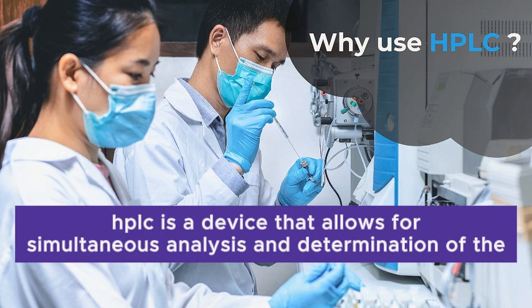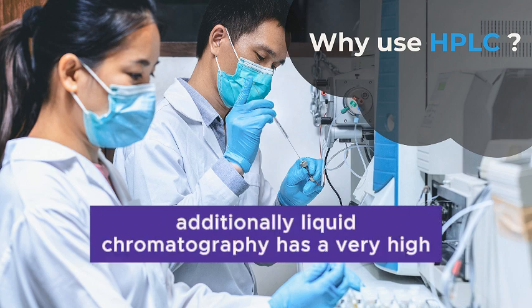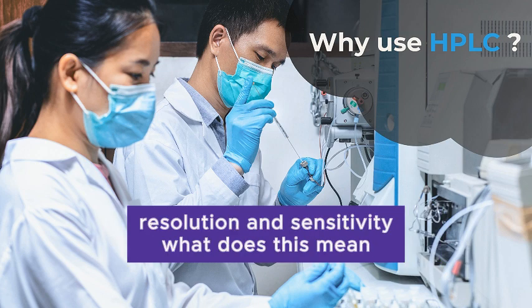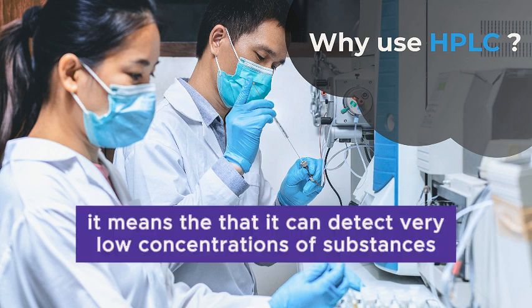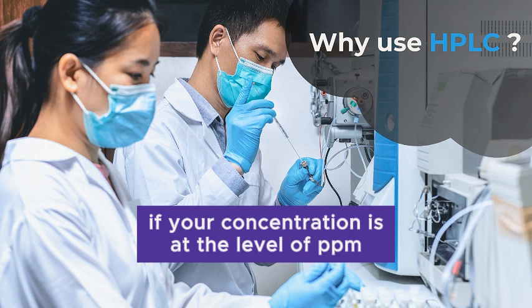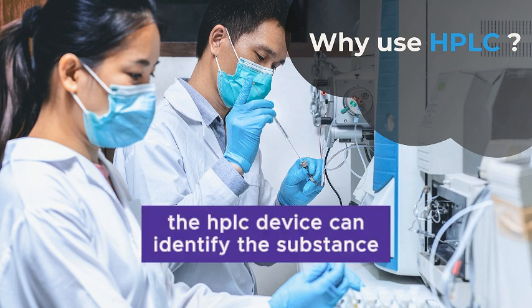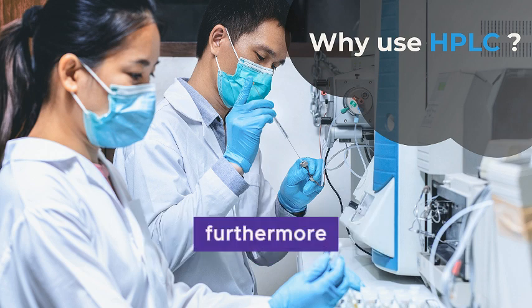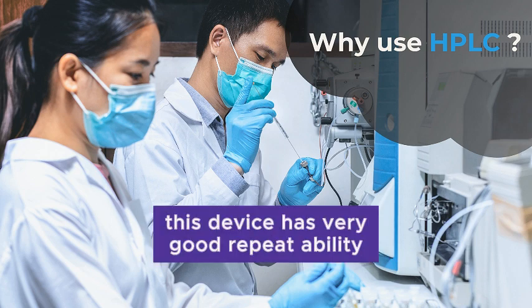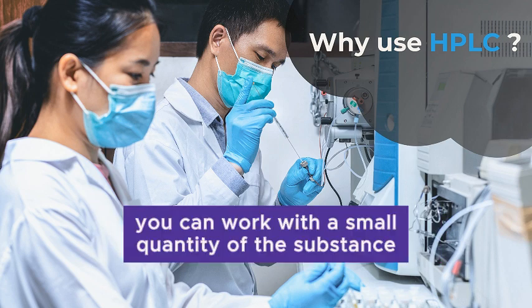Why should HPLC be used extensively, and what are the applications of this device? HPLC is a device that allows for simultaneous analysis and determination of the concentration of various substances. Additionally, liquid chromatography has a very high resolution and sensitivity. What does this mean? It means that it can detect very low concentrations of substances. For instance, if your concentration is at the level of ppm or, in some cases, ppb, the HPLC device can identify the substance. Furthermore, this device has very good repeatability, and you do not need to have large amounts of the sample, you can work with a small quantity of the substance.